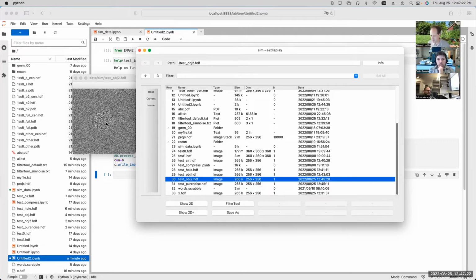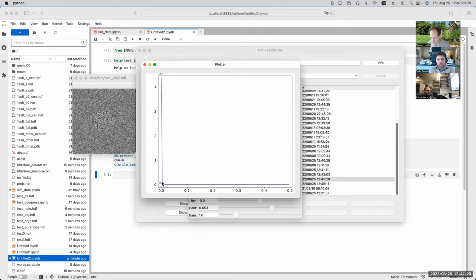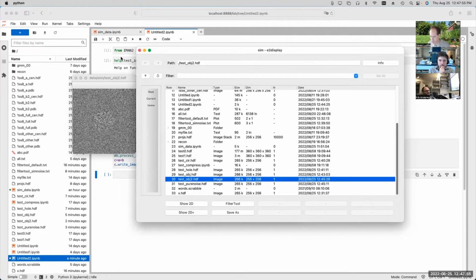The goal is to produce something which, if you look at the power spectrum of this, and get rid of that 0 peak, what we should see is sort of flat noise with some little lumps for the CTF where it is. And you can see this is really weak. We're barely seeing the CTF at all. So we'd probably be justified in amplifying our textured noise signal quite a bit more than what we're doing here.